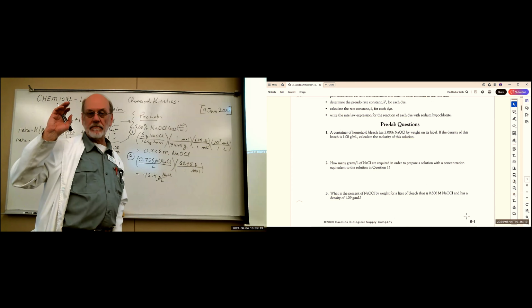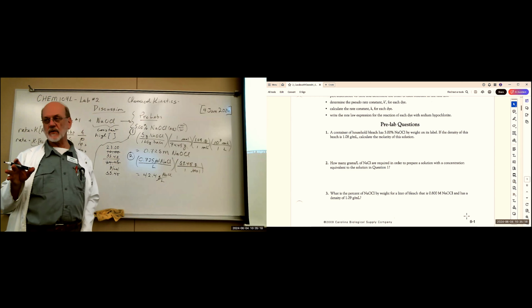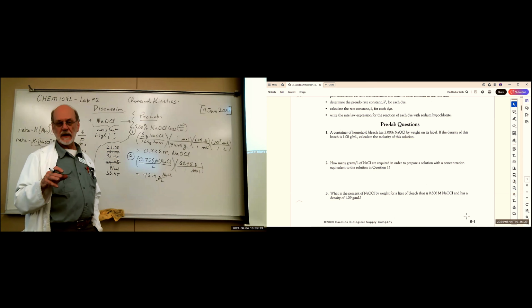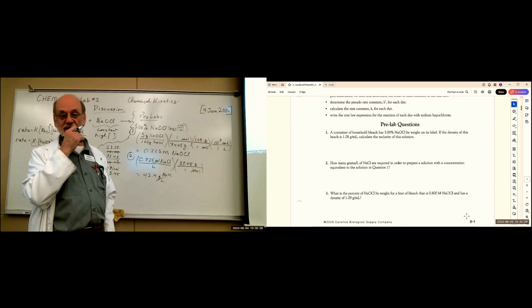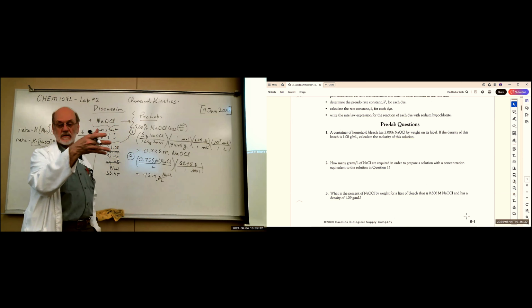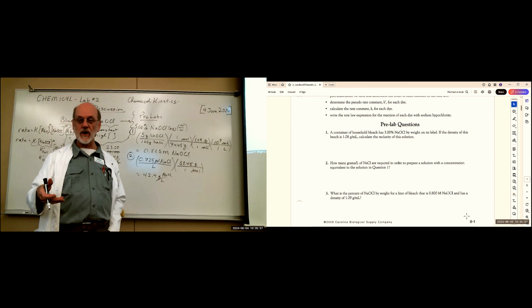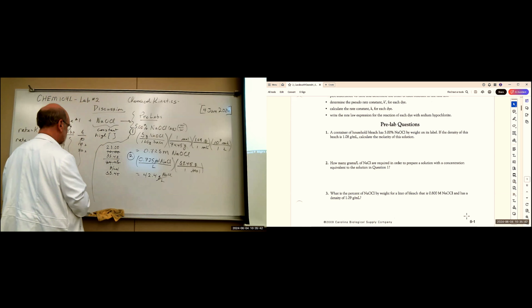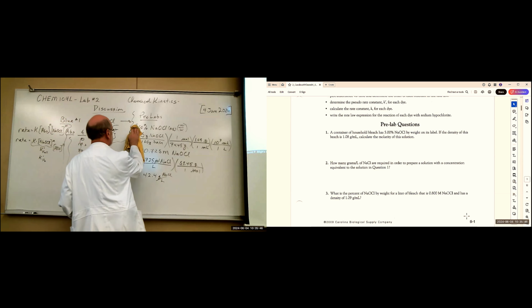Now, as far as the experiment goes, we're not using 5% sodium hypochlorite. We're using, I think, 6.5%. That factors into your calculation later. This is just to show you how we got there. And then I've already calculated how much of this you need to match the experimental bleach concentration. All right, so that solution is already prepared. So what do we have left? Number 3.